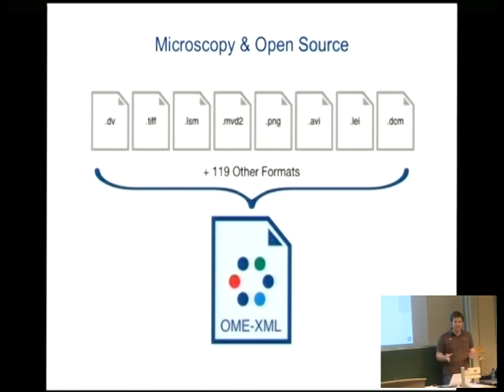So you're already locked into Delta Vision or some Zeiss format for whatever microscope you've got. Just in my group in Oxford, we have about 12 different types of microscope, and 8 different image formats come out of those. Each of those can only really be analysed in the tools that the hardware vendor provided.